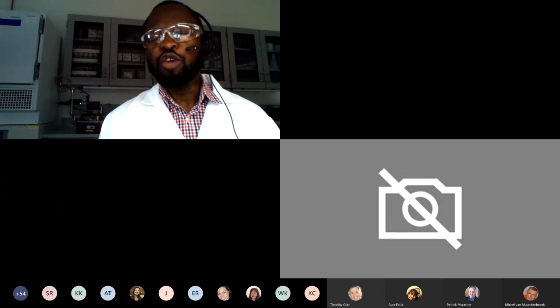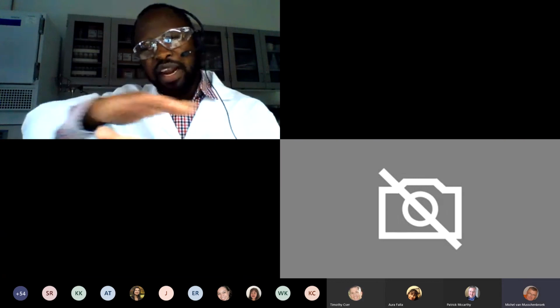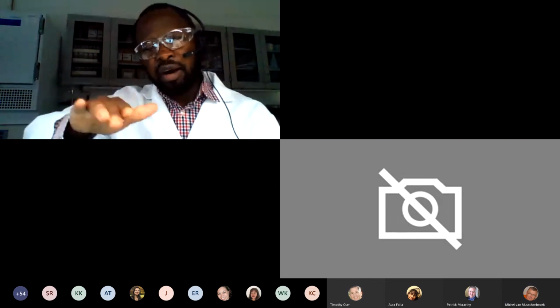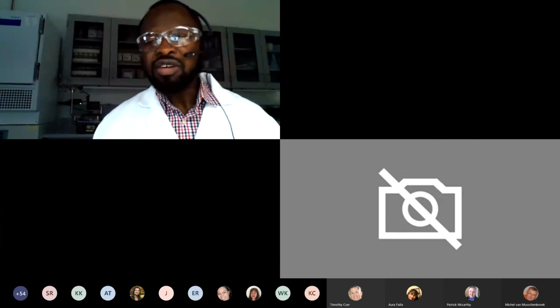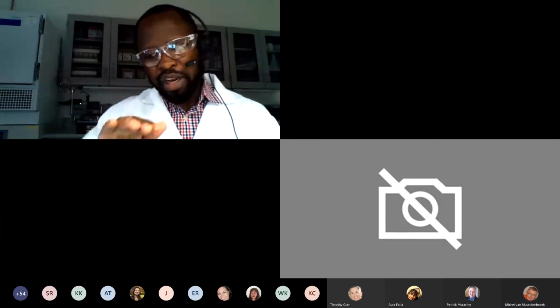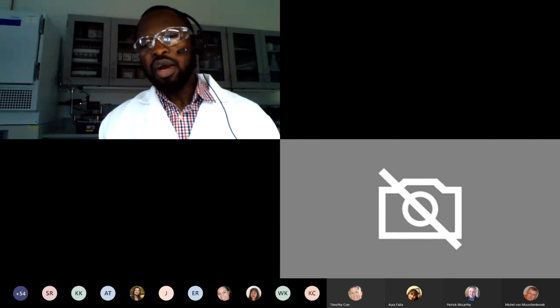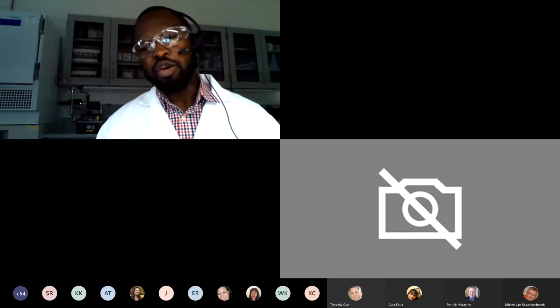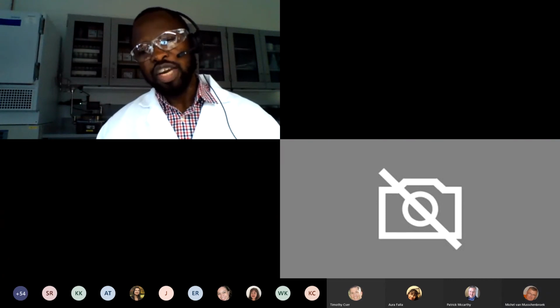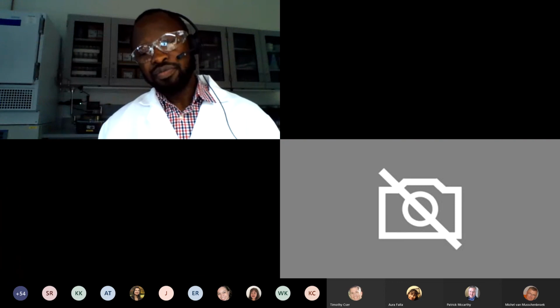Not allowing your filter to dry up helps a lot. Keep it moist. I always recommend leaving a layer of about 10 mils in there, not emptying the whole liquid. If it does, let it stay wet. It's always better to leave a layer of diluent on your filter, unless it's time to add the media. Don't let it dry out, but you can let the whole diluent filter through while it's still wet, then add your product.